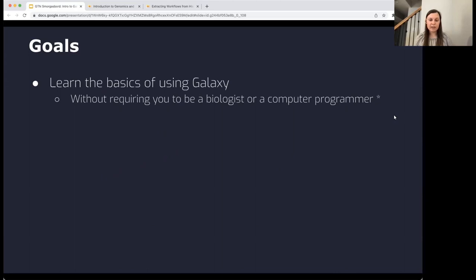The goals of this tutorial are to learn the basics of using Galaxy. You'll be able to explore the tool and walk through answering a scientific question without necessarily needing to be a biologist or a computer programmer. Today's tutorial is focused on a question in genomics, but there are many other tutorials on the Galaxy Training Network covering other scientific topics.